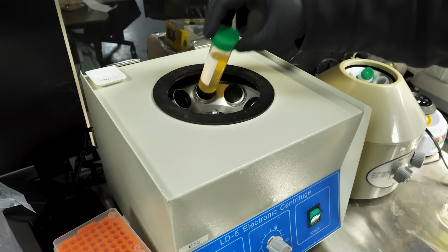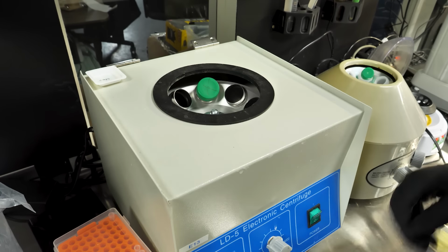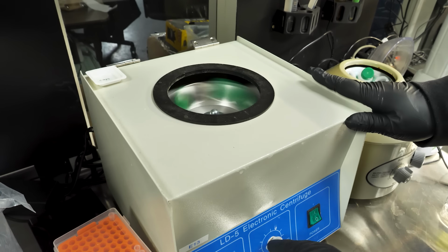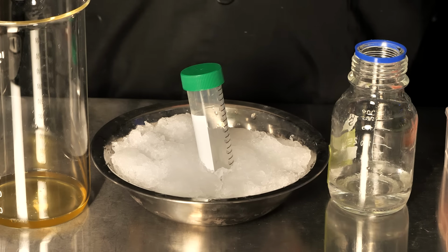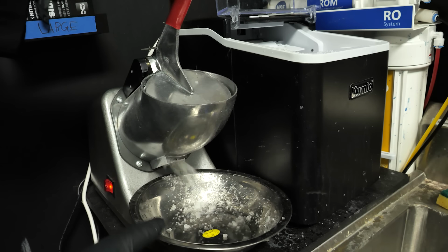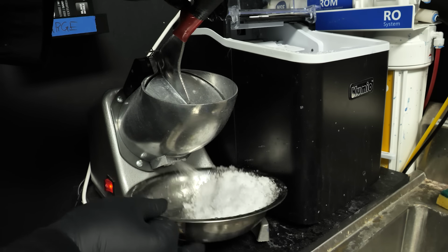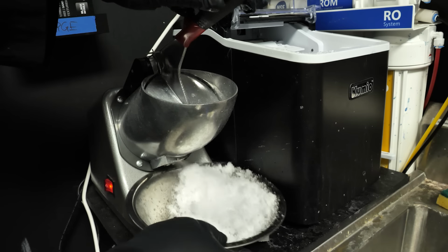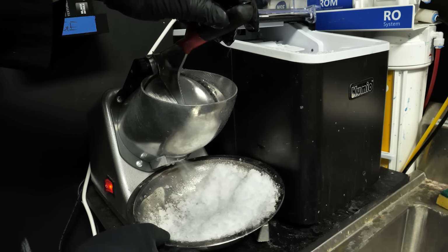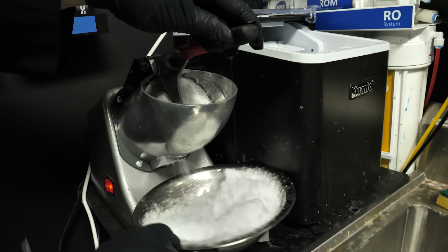With our bacteria grown enough, we need to wash them to get rid of any of the LB and other salts or side products that will impede the DNA going into the cells. And to do that, we're going to be using a centrifuge and a bottle of sterile 0.1 molar calcium chloride solution. But before we do, I'm going to prepare a crushed ice bowl to do all the work in. From this point in the protocol, we want to keep everything very cold. Not frozen, but around 2 or 3 degrees. While the protocol will work without ice, we've checked, and ice actually improves the effectiveness enough to be worth it.